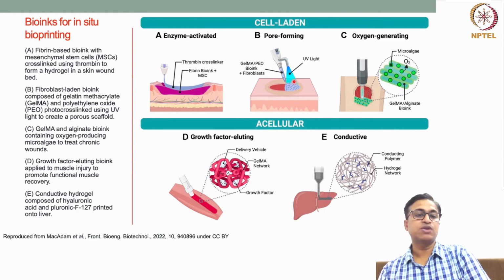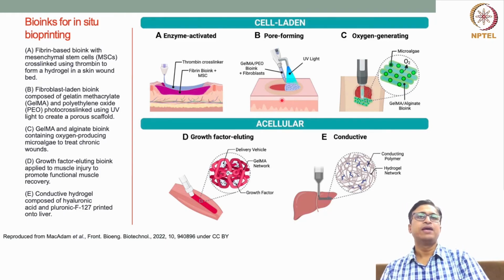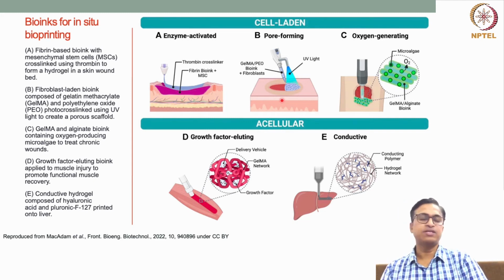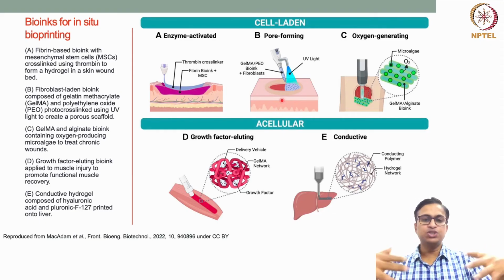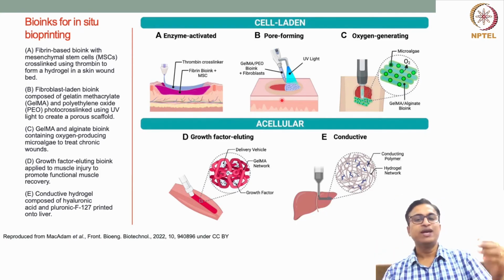So this technology can be very well used whenever we are trying to bioprint a construct with some porosity, and porosity helps for different applications, like cell migration, even nutrient transport, and also these pores can be available for new tissue growth. The tissue ingrowth happens from the surrounding native tissue, and that time these pores can become handy.